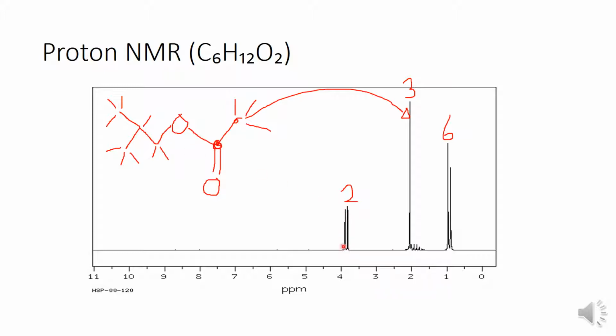Starting here, if we go to the next adjacent carbon, it breaks off into 2 groups, which are these 3 hydrogens there and here, which means that this is our group right here. Moving, and we're going to put that arrow right there.